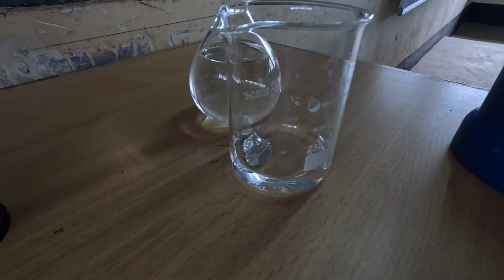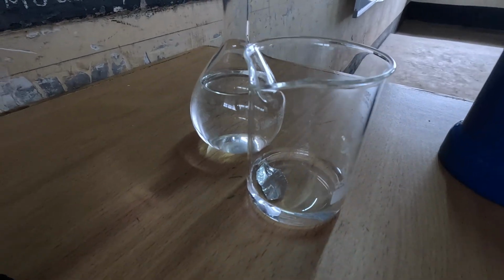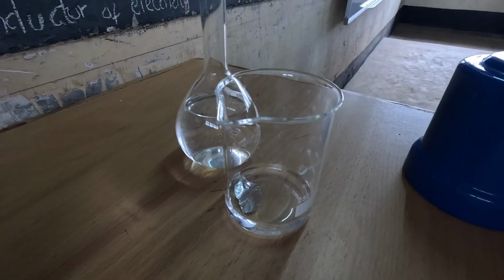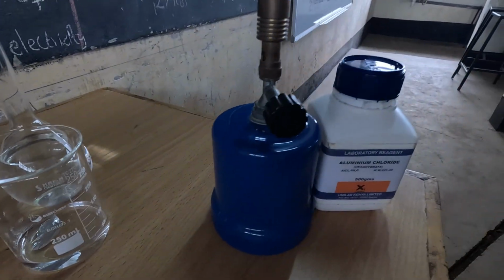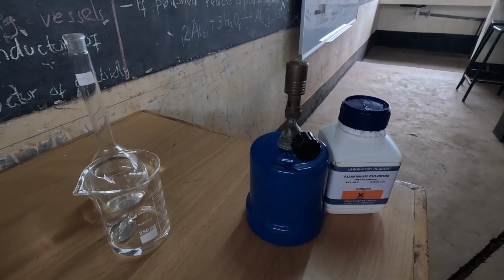So aluminium is not quite that reactive, and we are going to try to burn our aluminium, and we will burn it on our portable burner and see what will happen if we try to burn it on our portable burner.